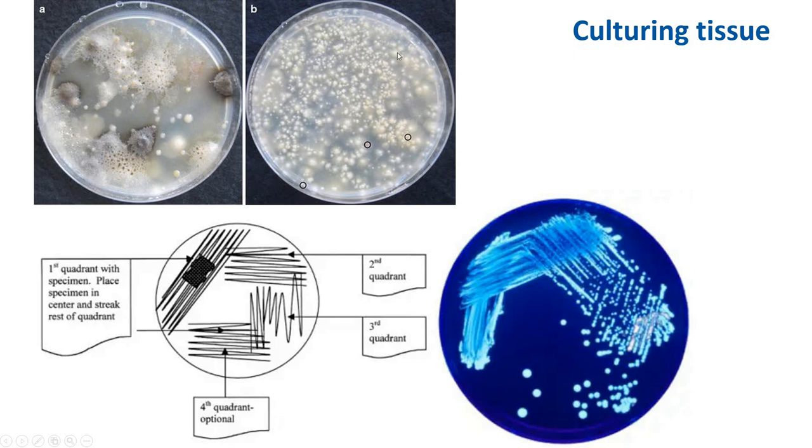Here is a very successful plate — what it looks like. You see thousands of spores germinating, and you want to take some of this section and basically transfer it in a pattern to obtain a single colony in the end.